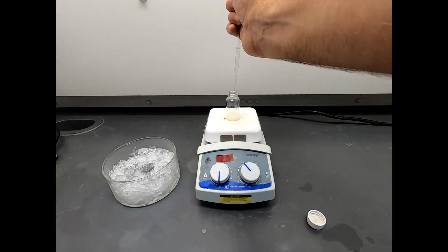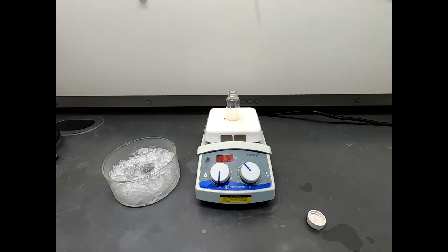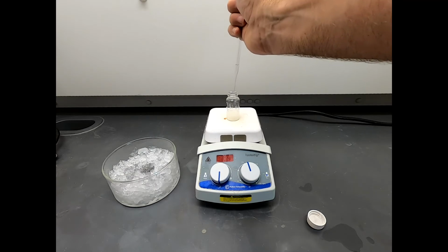So let's drop-wise add this. Whenever you're mixing solutions, it's good to add them with some mixing. Don't just slop all the water in there at once. Let it all kind of go in slowly. Okay. Okay, that looks good.